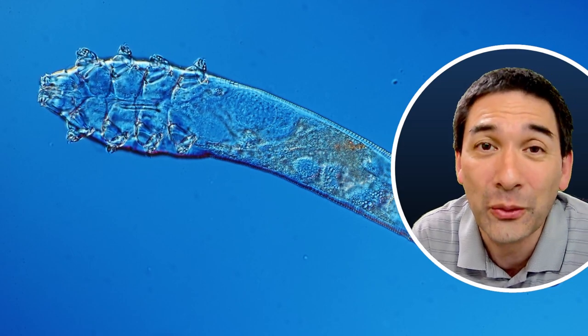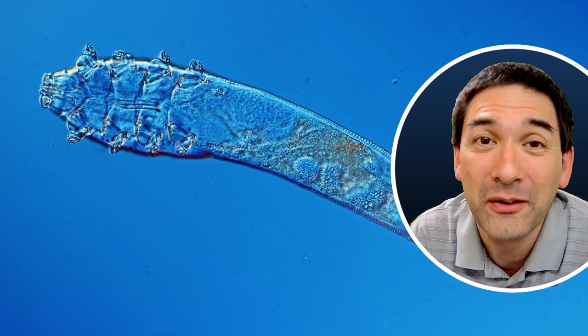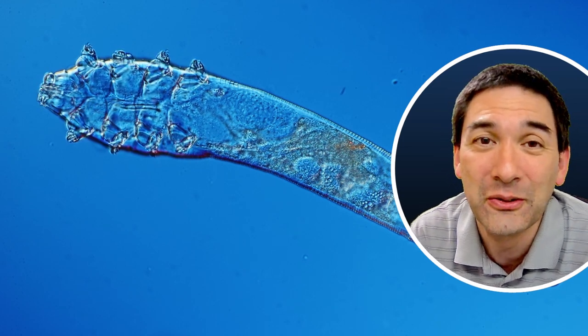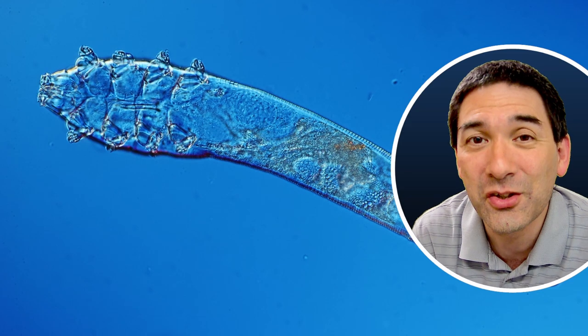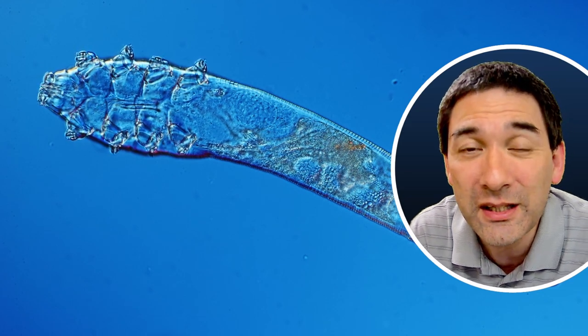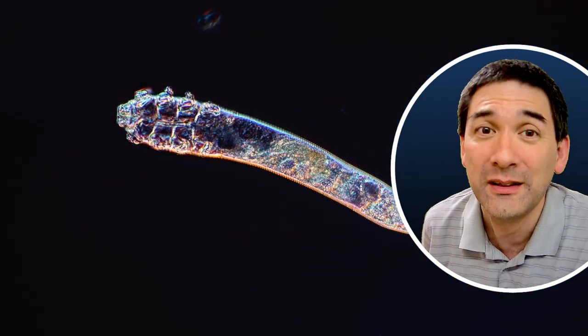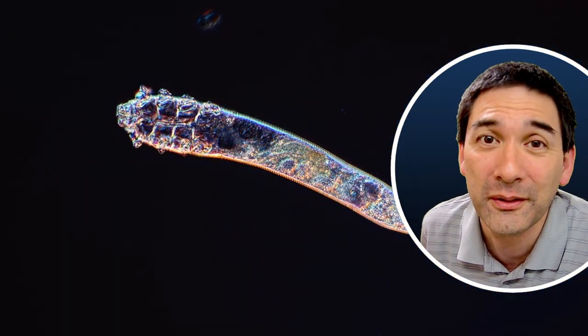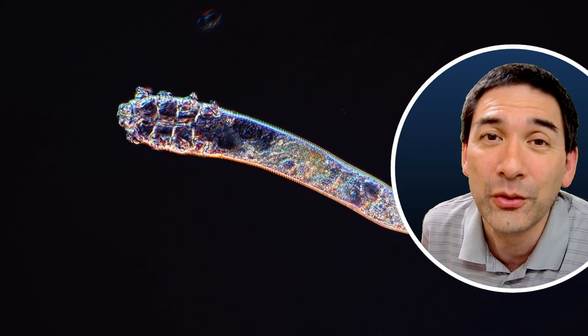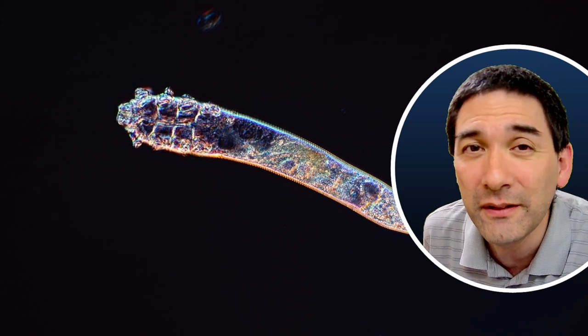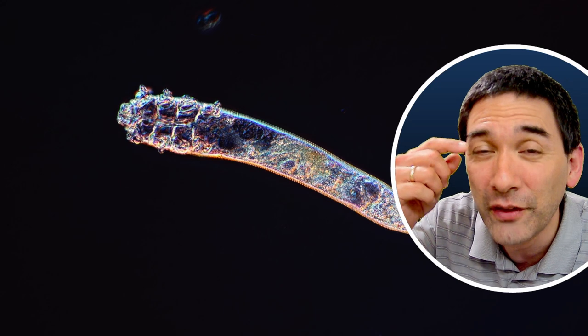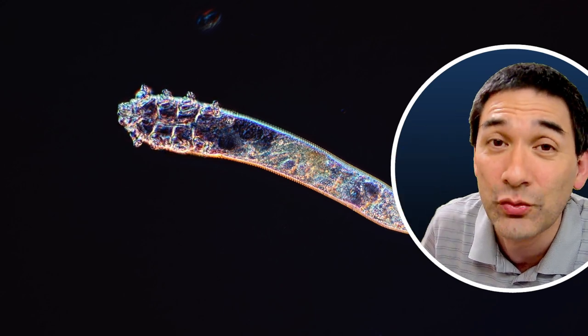A very favorite organism of mine, many of my YouTube viewers also like to observe this, and this is so-called a face mite. Demodex face mite, and I extracted them from my eyelashes. Here another using a different contrasting technique here, and those Demodex face mites, they live in the hair follicles of the eyelashes and of the eyebrows, and I extracted them.